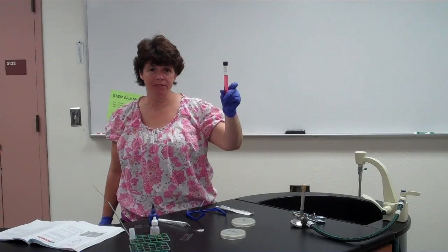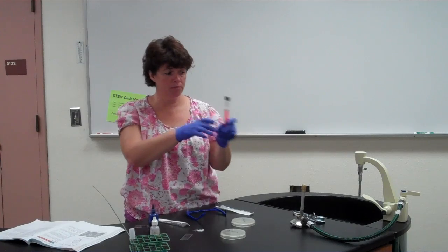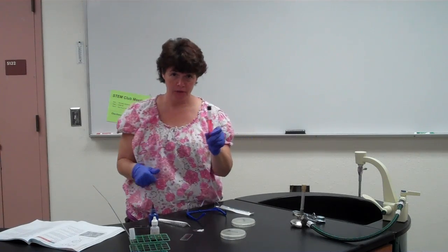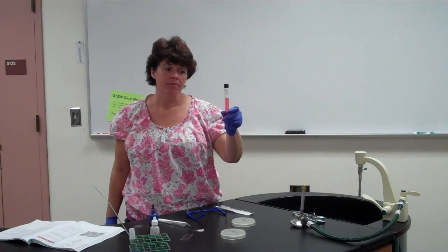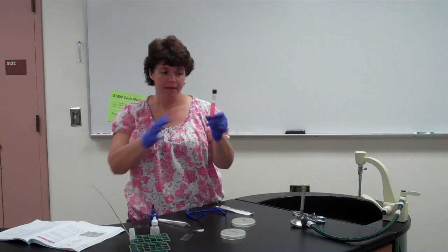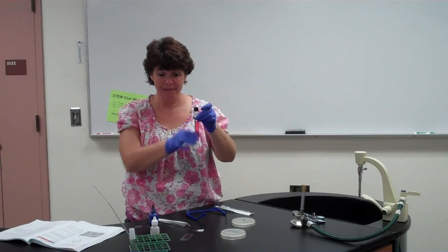So exactly what we did with the bacteria when we looked at fermentation, you'll inoculate the tube using all your sterile technique. You'll put it in the incubator a little bit loose so that it can get some air. But instead of being red, it will be purple, but you're going to be looking for the same results. It'll turn yellow in the presence of acid, and then gas will form inside that Durham tube if that yeast produces gas. Okay? Now for this, you'll have 5 of them.